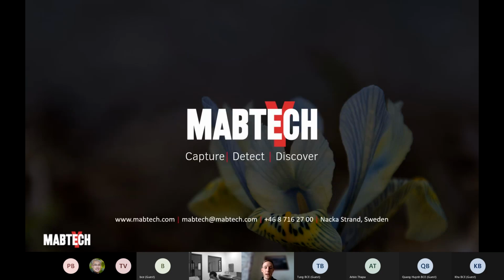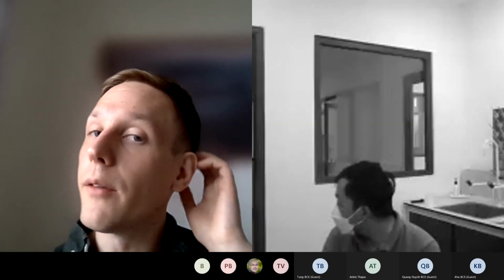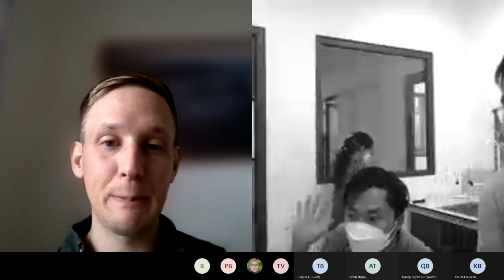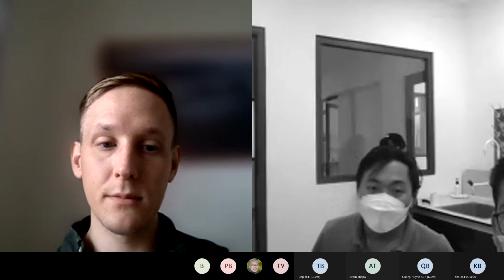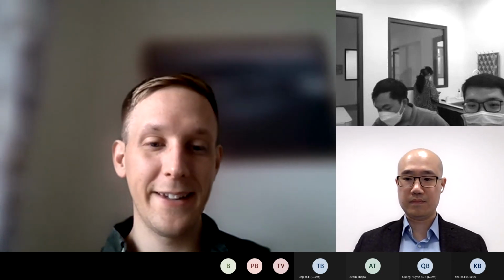And apart from that, that was actually the more product related presentation. So do you have any questions about the product at this stage? I know there's a lot of new information and you don't have to know everything by heart right now, but is there anything that you would like to ask? We don't have anything to add. Great.